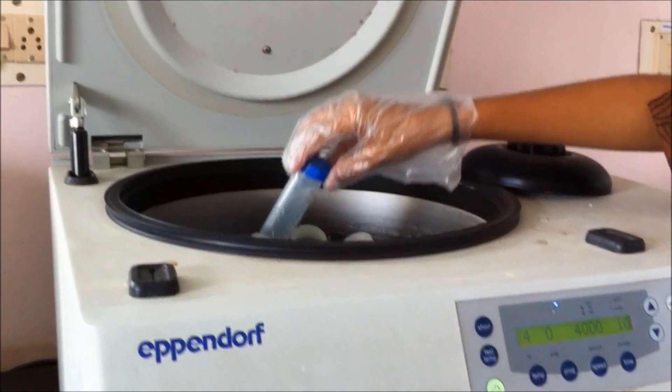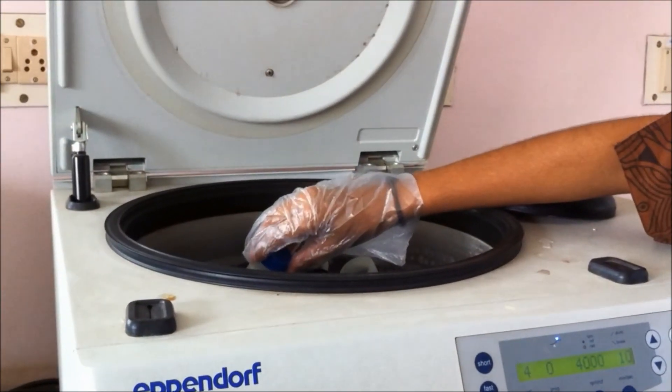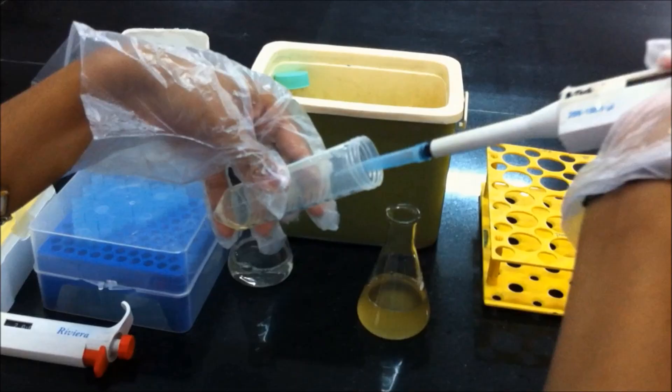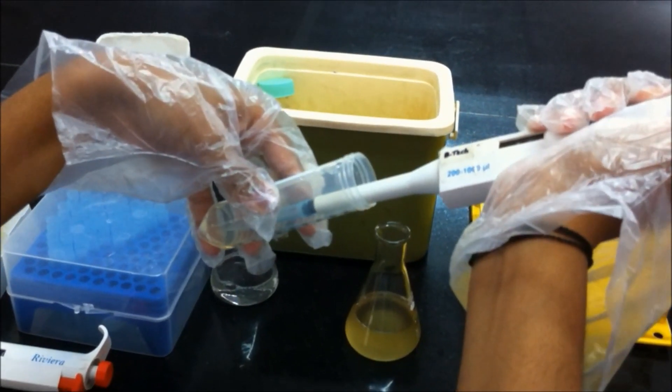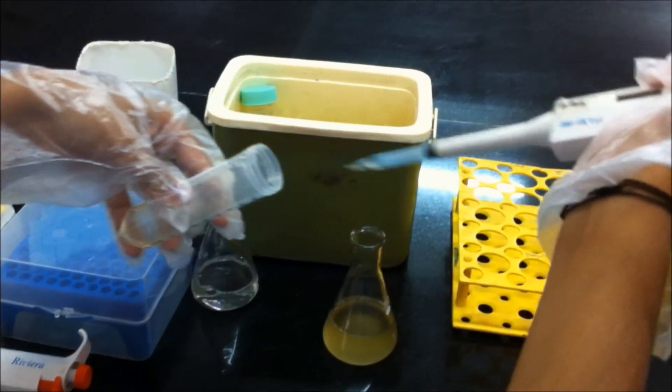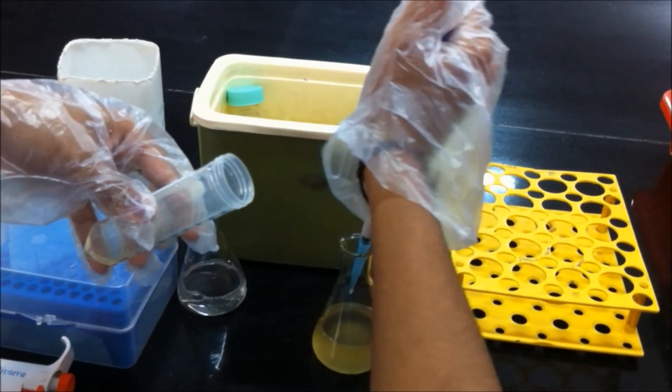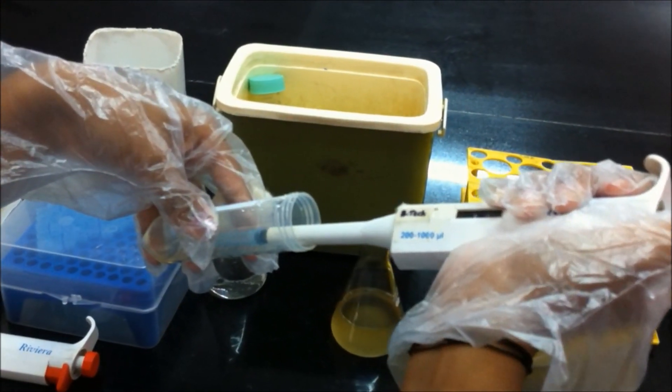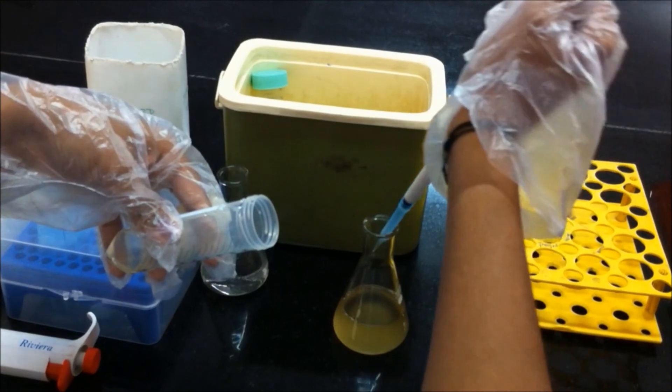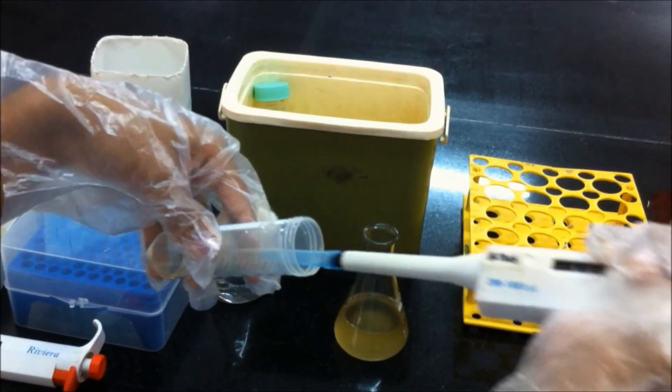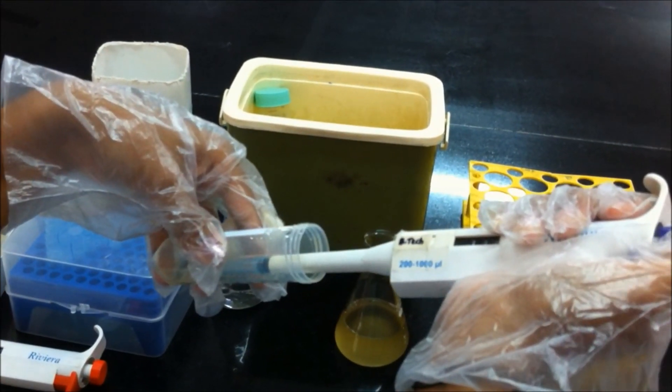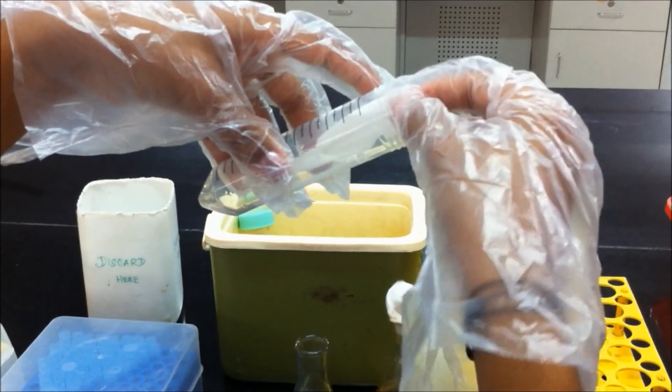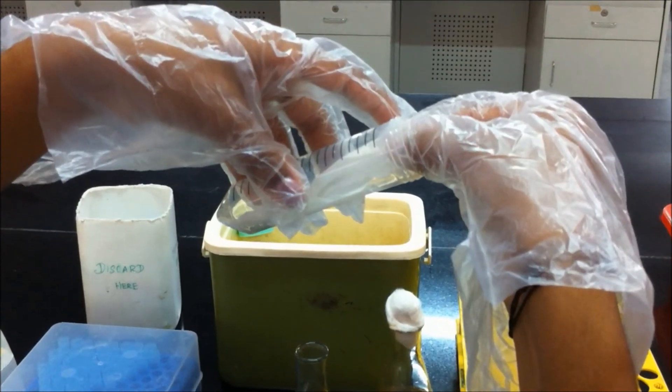Centrifuge at 12,000 rpm for 5 minutes. Decant the isopropanol and drain the pellet well. Blot excess liquid onto clean tissue paper or paper towel.